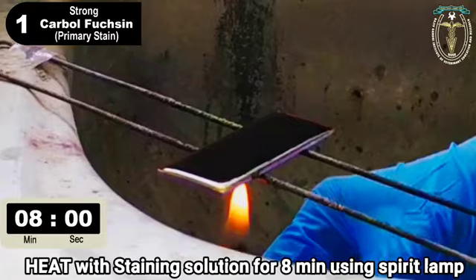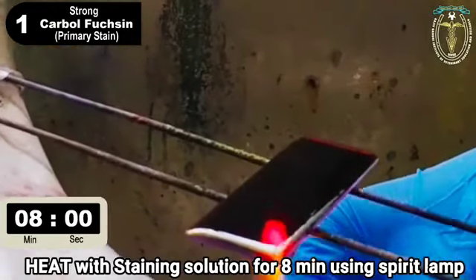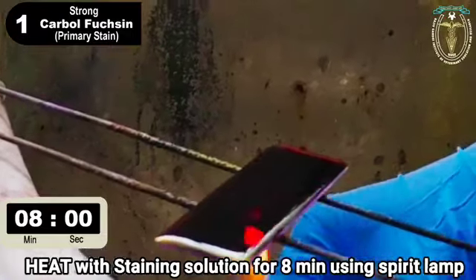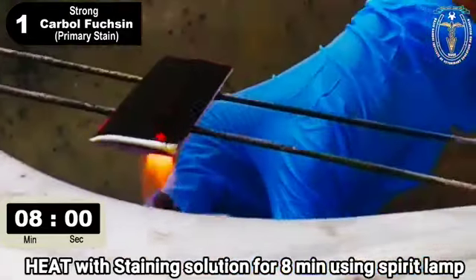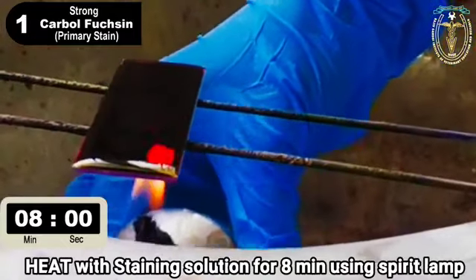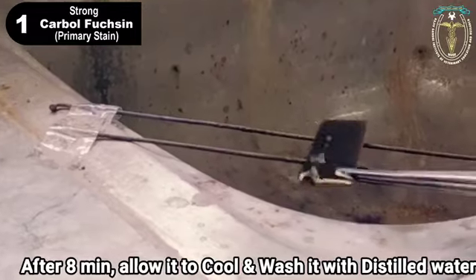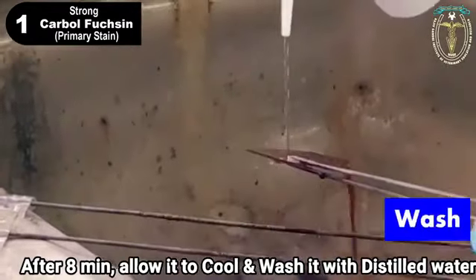Allow the heated stain to remain on the slide for 8 minutes. Great care must be taken when heating the carbolfuchsin. Only a small flame should be applied under the slides using an ignited spirit lamp. After 8 minutes, allow the slide to cool down, and then wash it with distilled water.